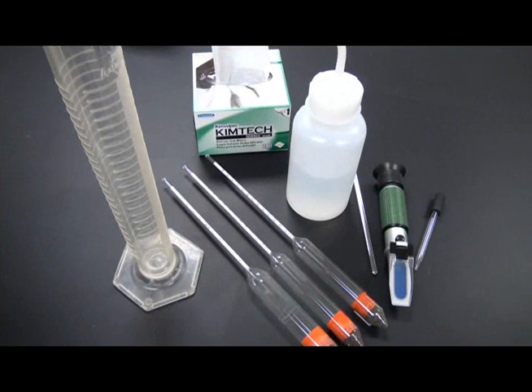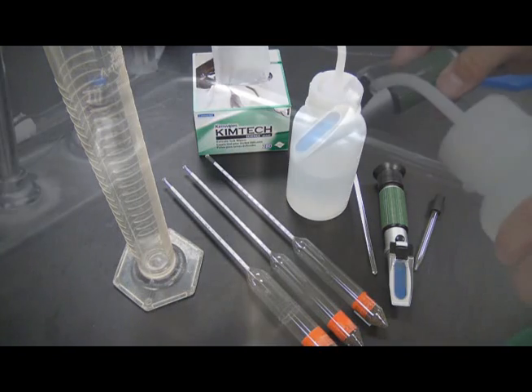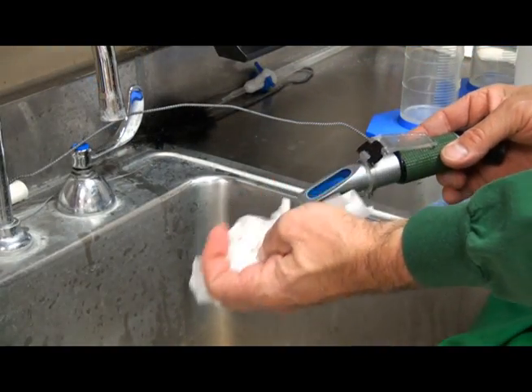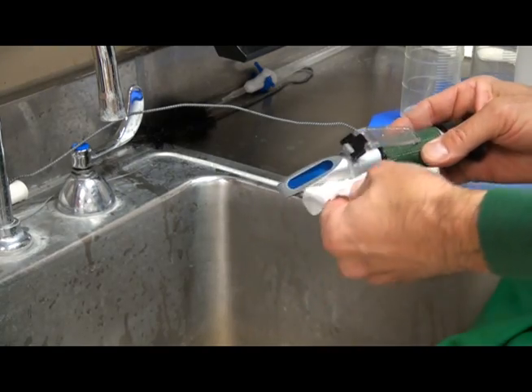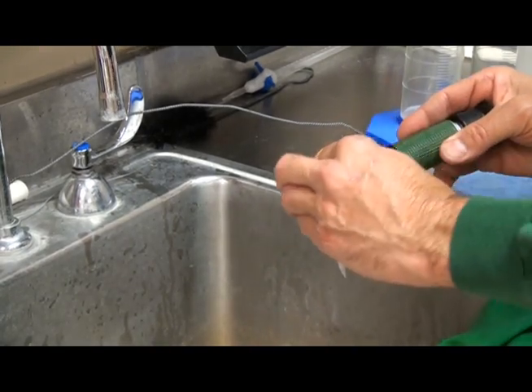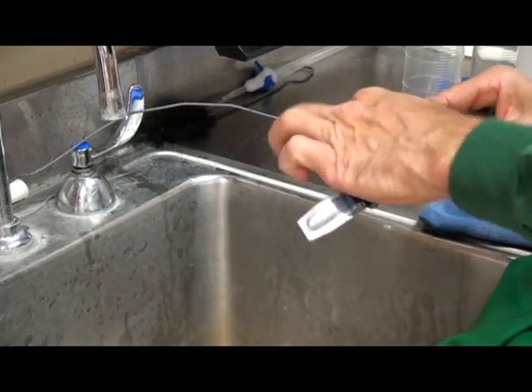Equipment used for testing brix should be cleaned thoroughly between each test and after final use to prevent cross-contamination of samples. Clean the prism surface and lens cover with DI water immediately after sampling. Dry the lens with a chemwipe. Clean the exterior of the refractometer with a damp cloth to remove any spilled juice samples.